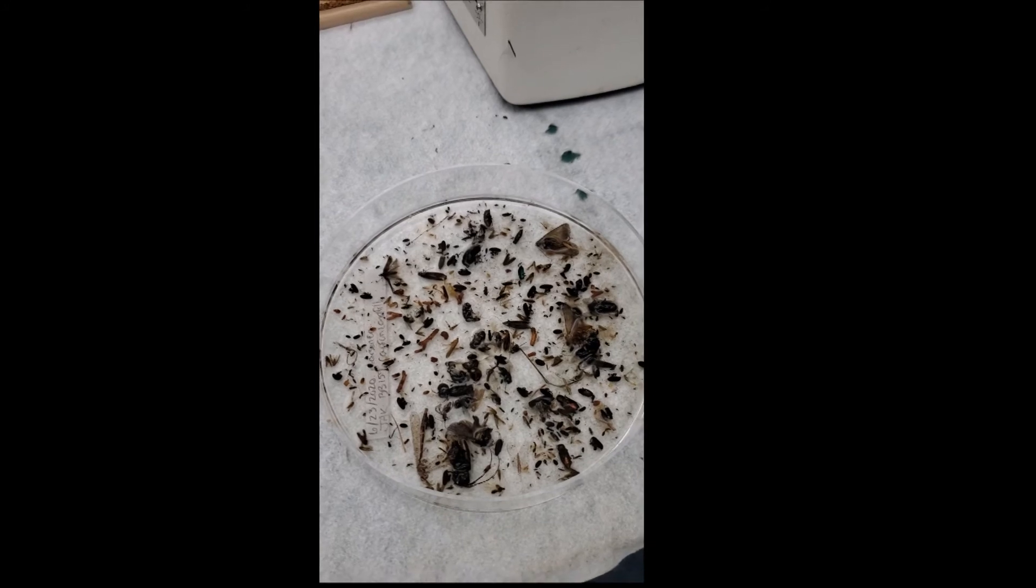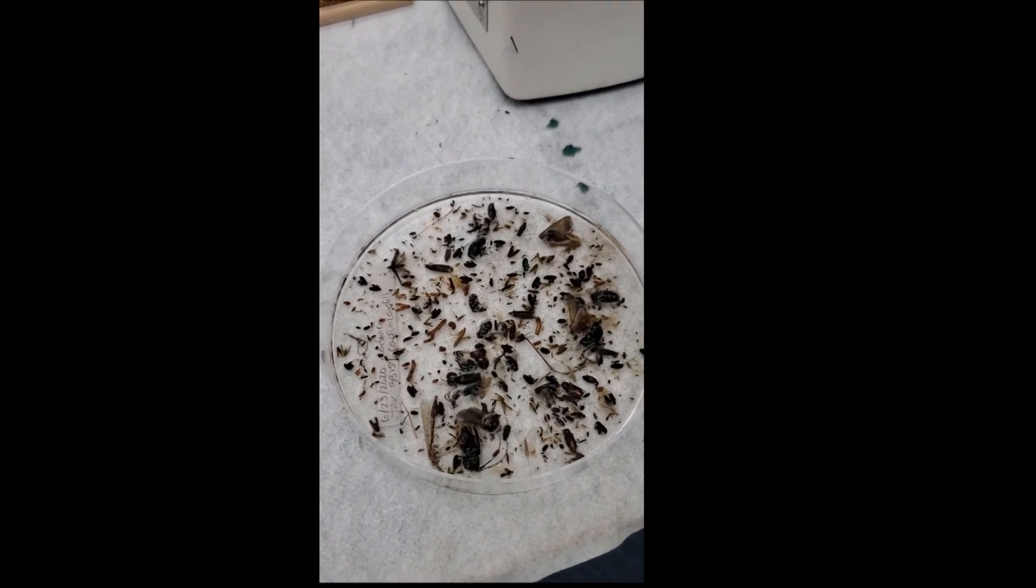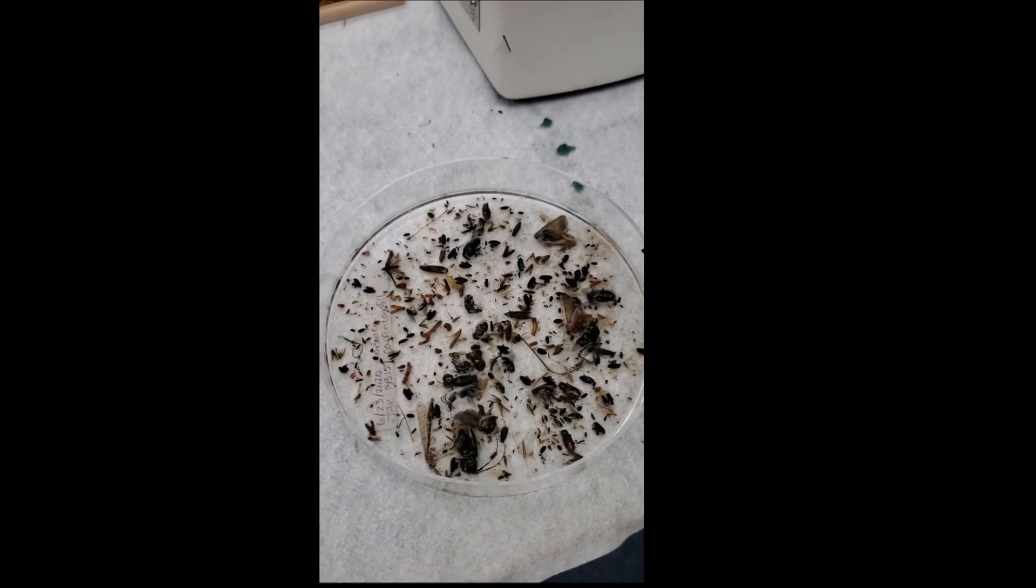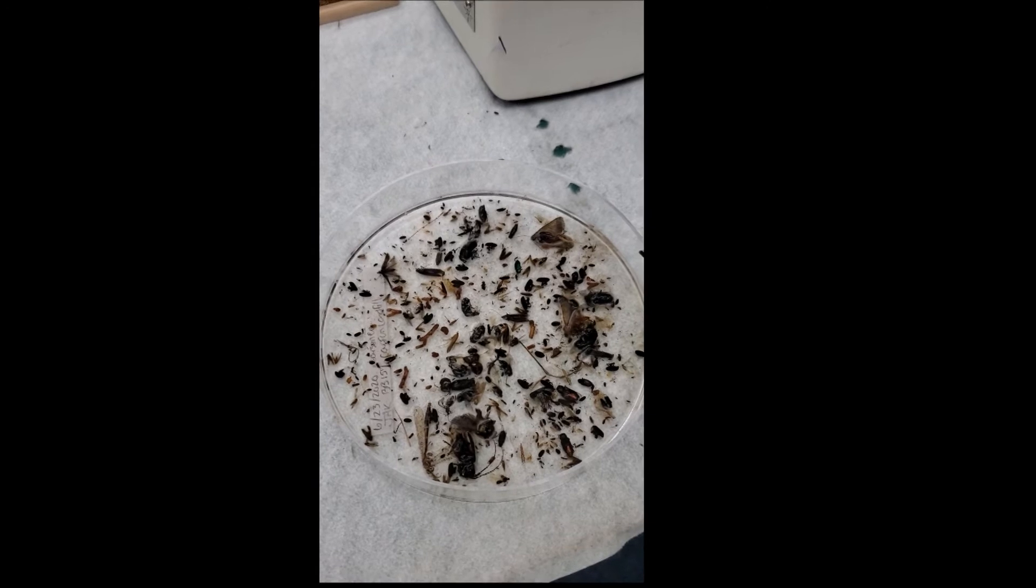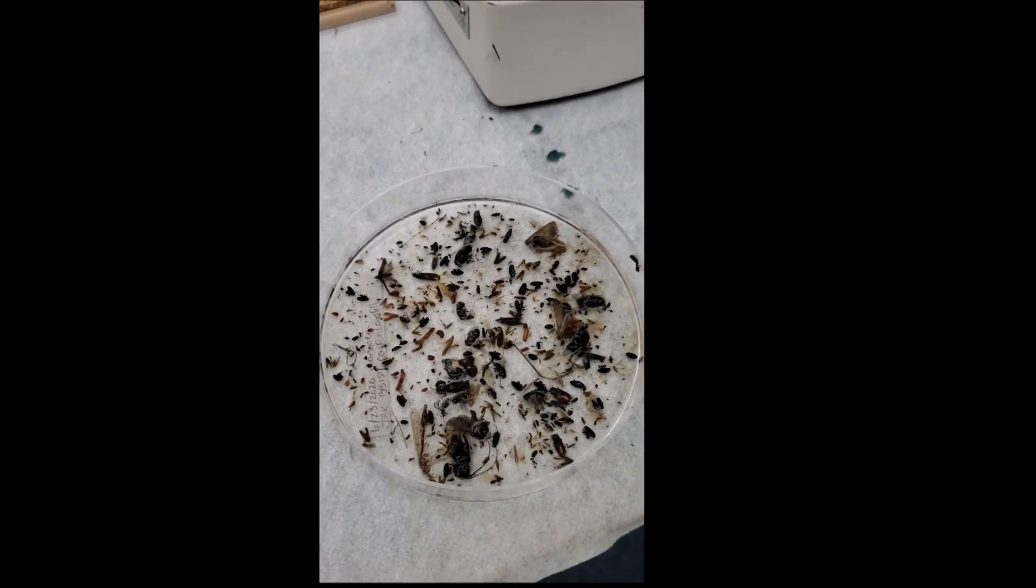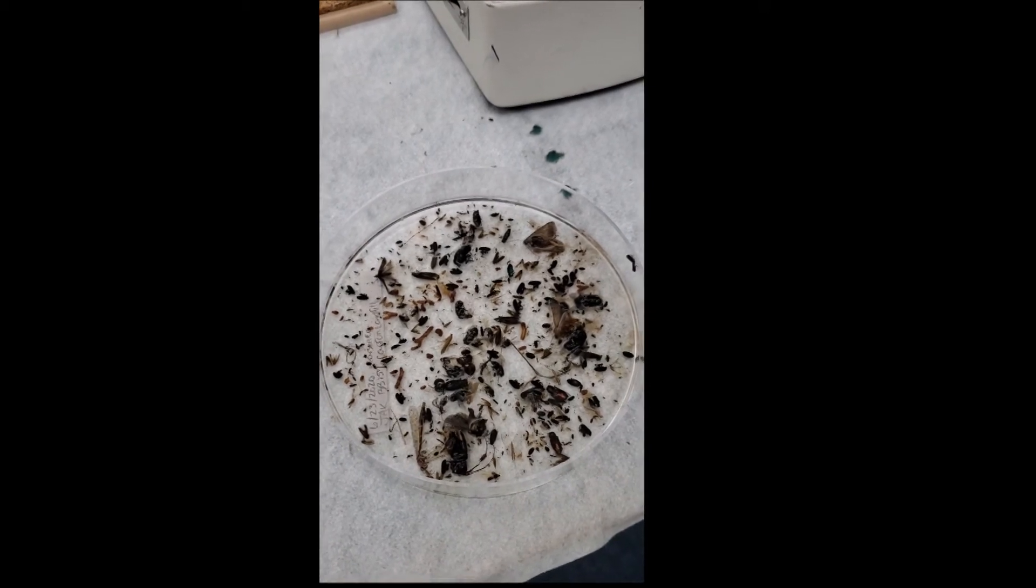This is a sample from a bark beetle trap. You can see that there's hundreds of insects in here. We have to go through and look through the material and see if there's any of the species or the insects that we're worried about, and sort those out and identify them.